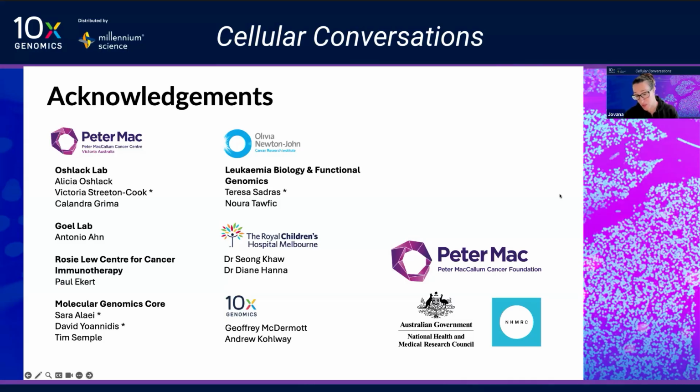And it's specific to fusions, but I don't see why you couldn't do that for any kind of expressed structural rearrangement that you're interested in, like some sort of insertions or deletions or anything like that, that gives you that very specific target that a probe could be very good at discriminating from the wild type, say.